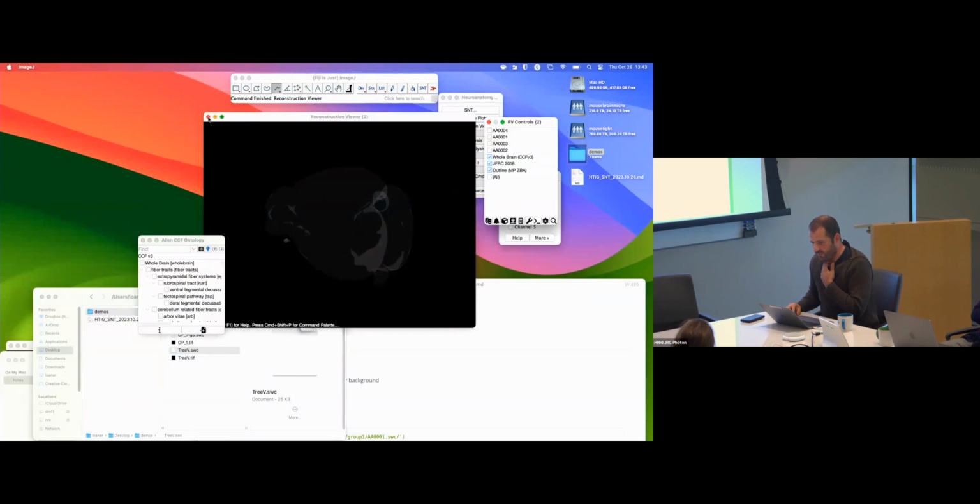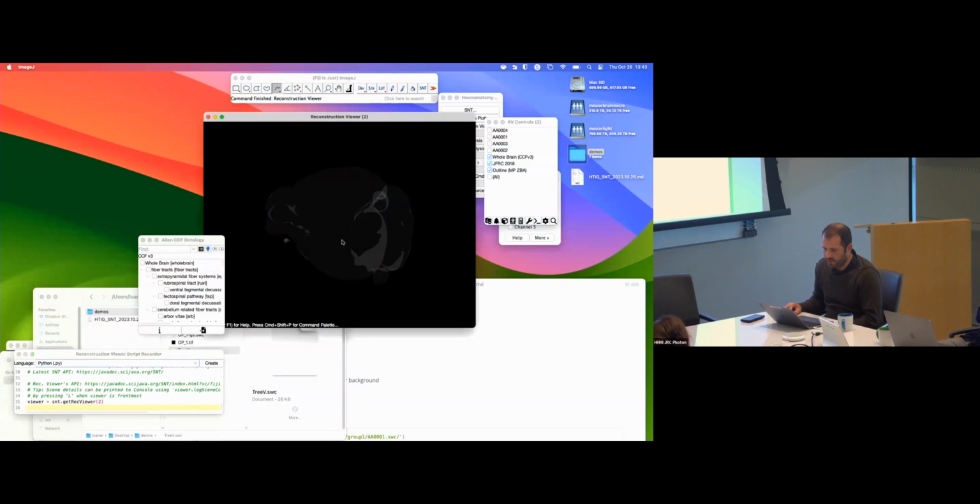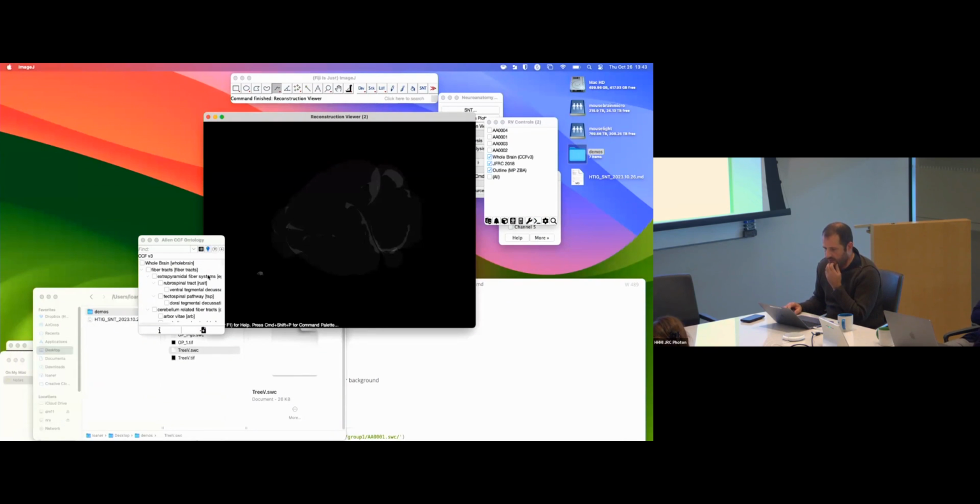So anyway, this has the recorder too. You can use the recorder, but I guess you guys probably will never use it. Again, there's a script recorder here too. You can record the script and do stuff and it will log here, and then you can use that on your own or you can just start one of yours.